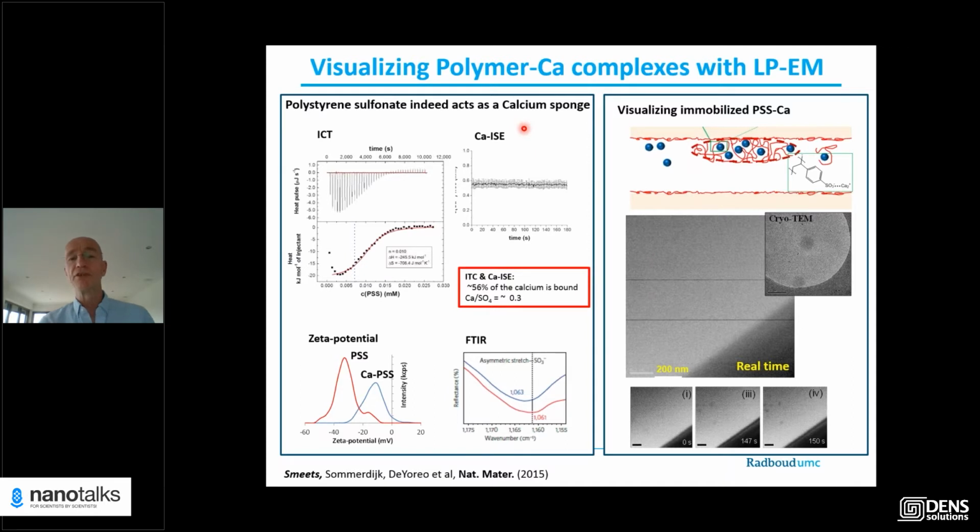And when Paul introduced that polymer into the liquid cell, it forms complexes with the calcium, and it sits on the surface of the window of the cell. If we introduce it, we see these very vague blobs appearing. And they are very vague because they consist of calcium and polymer, but mainly of water. These are actually hydrated globules that are sitting at the surface of the window.